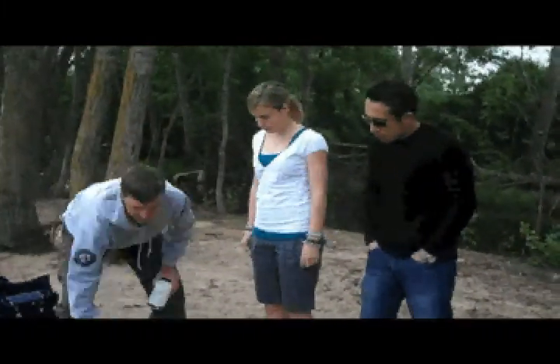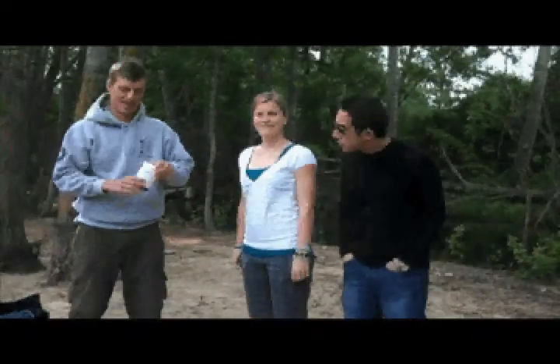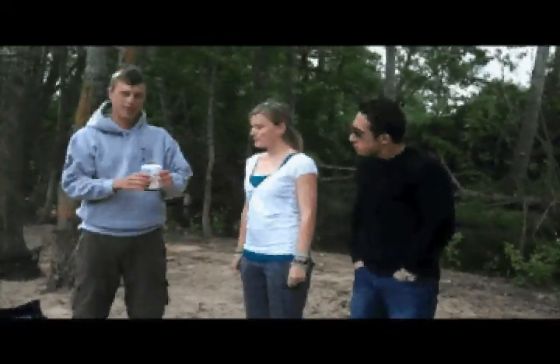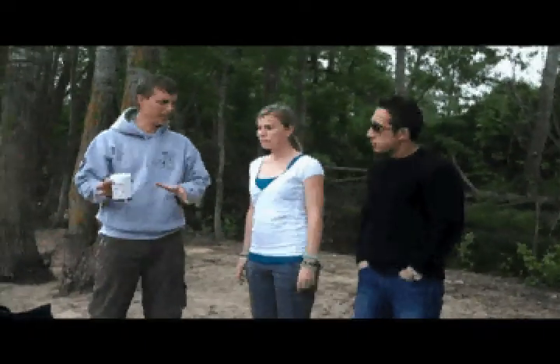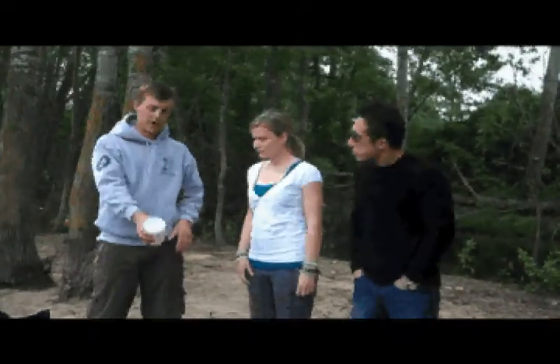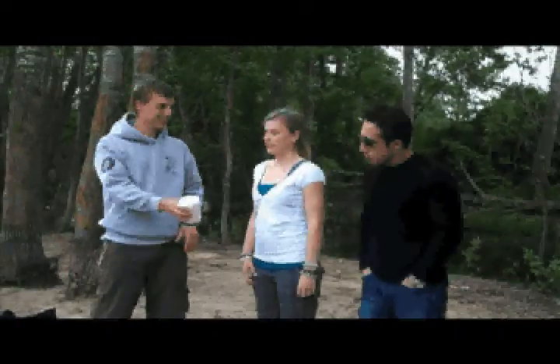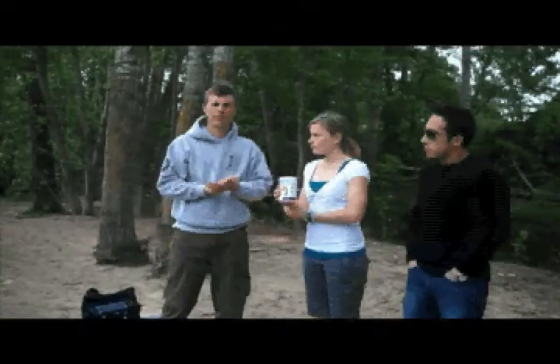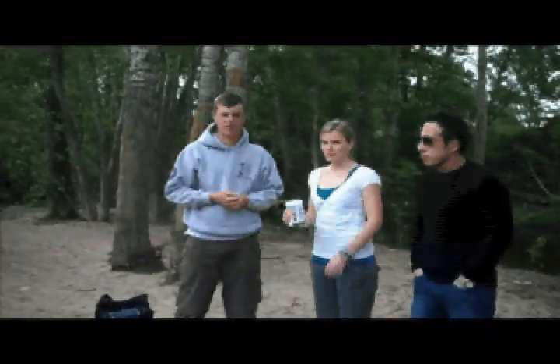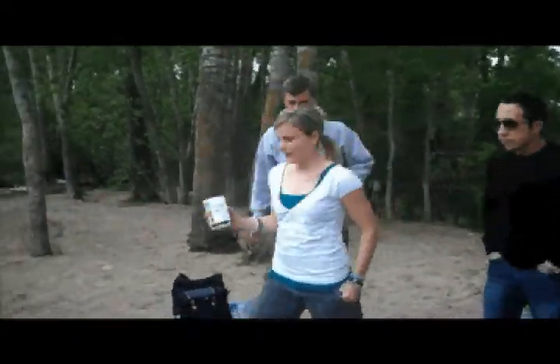So our brave subject Hillary here, on a nice brisk morning, will go out into the river and plunge this. Just don't go too far, just a little bit so you feel comfortable. Plunge this under the water. You've got to hold it there for about a minute. So this is where it gets exciting. And try to do it facing upstream. You always want to face the flow when we're taking water quality measurements. So start with that.